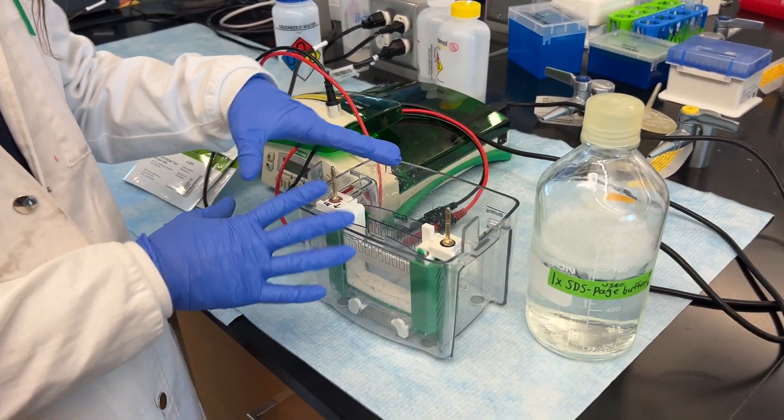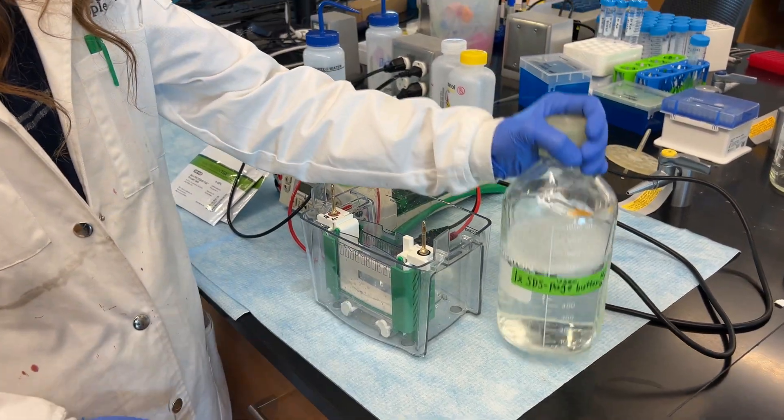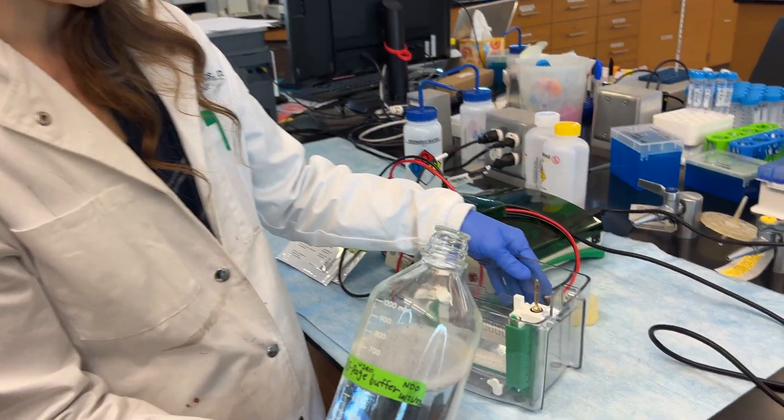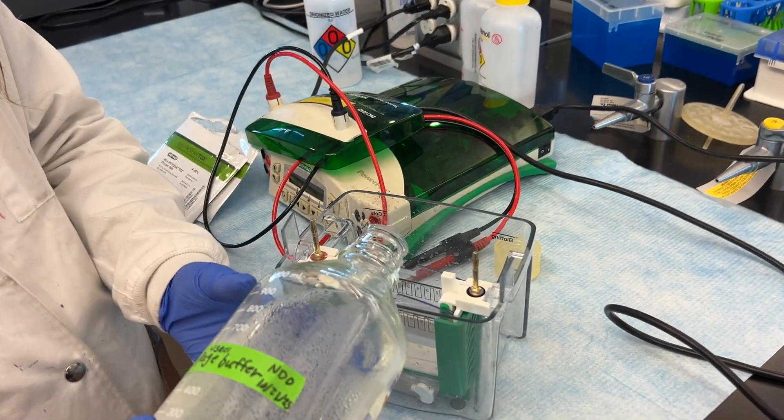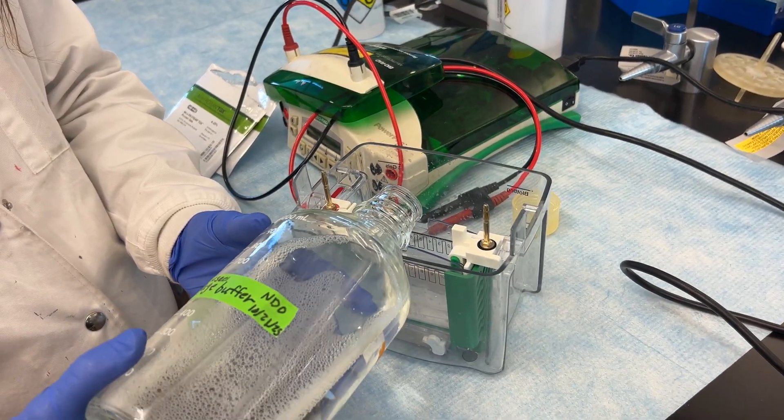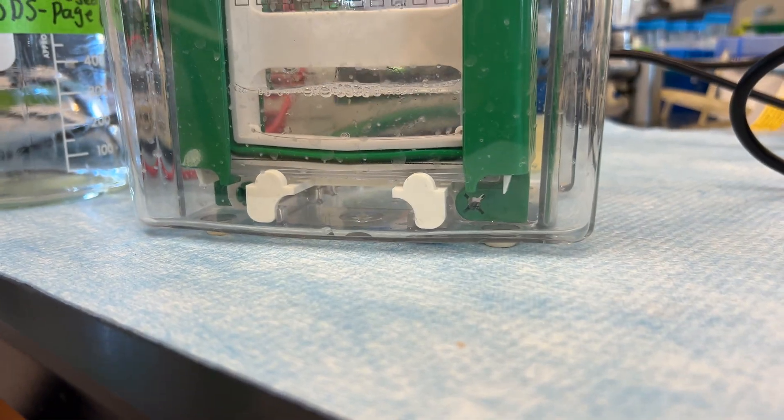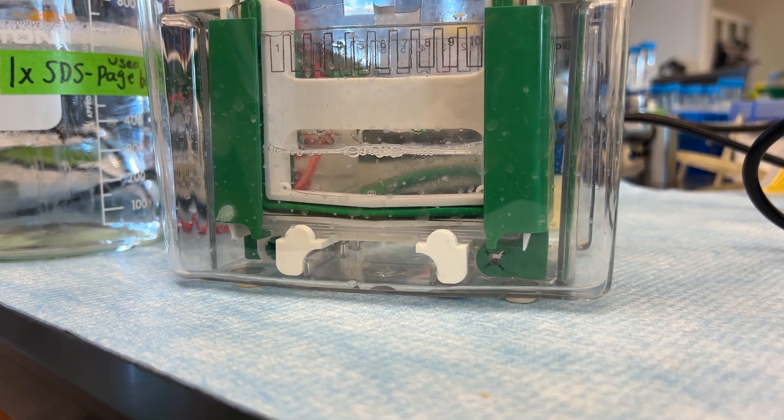In order to make sure that you actually do have a sealed cassette, what you want to do is take some of your buffer and pour a little of it into the center. And now you want to look and make sure that the line is not going down, you're not leaking.